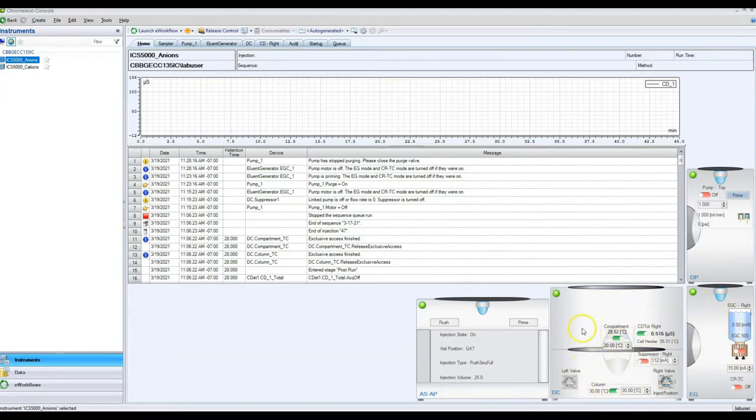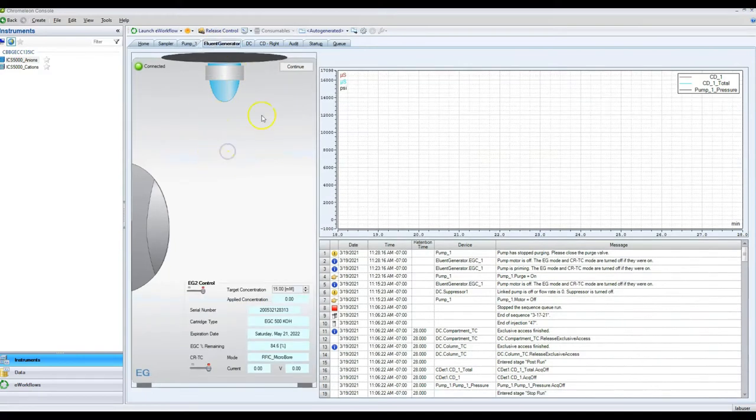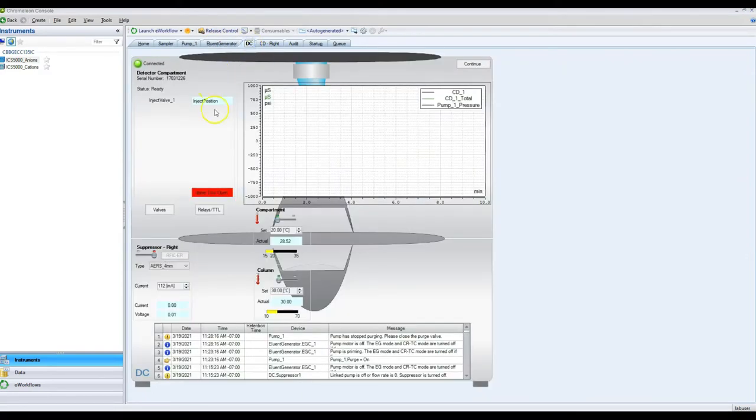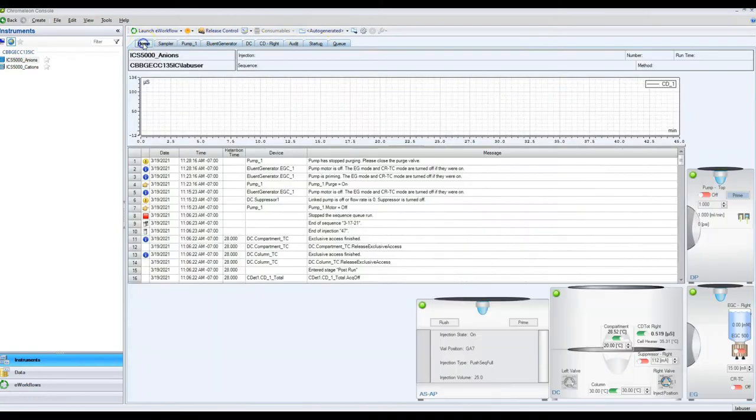If you only want to run one type of analysis, you only need to work with one side. But if you want to run both anions and cations, you need to get both of them ready. We have tabs at the top for both sides — each one corresponds to a different piece of equipment: the auto sampler, the pumps, the eluent generator, the detector compartment, and the conductivity detector, which is one of the most important ones.